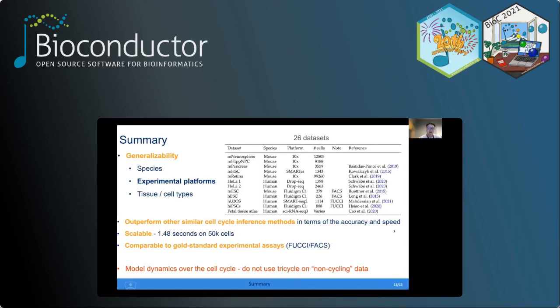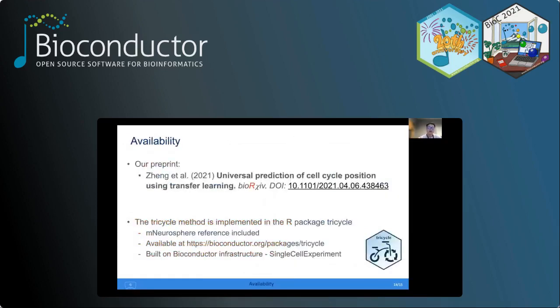But I also want to mention that since the motivation of the tricycle is to model the dynamics over the cell cycle, we do not recommend using tricycle on non-cycling datasets. The method is described in our preprint, and the function is available in the Bioconductor package tricycle.